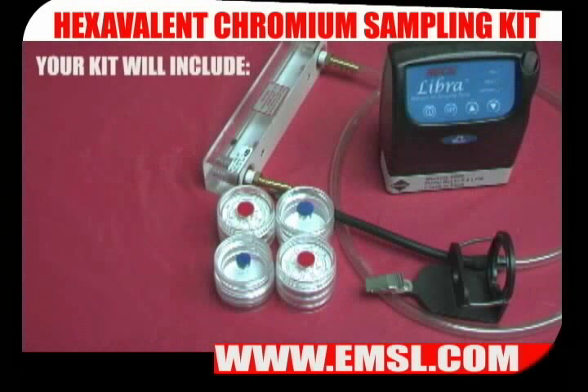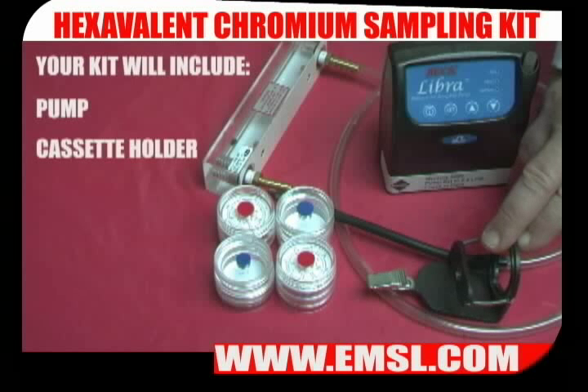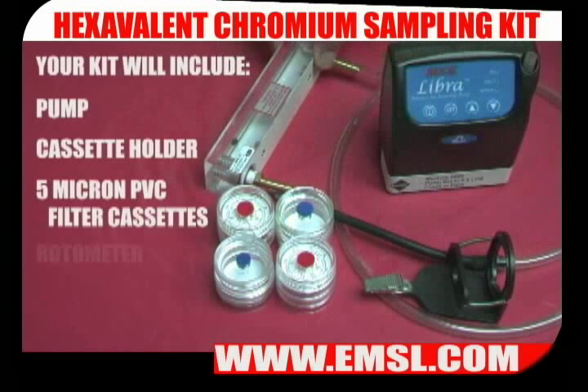The hex chrome sampling kit contains a pump, cassette holder, 5 micron PVC filter cassettes, and a rotometer.